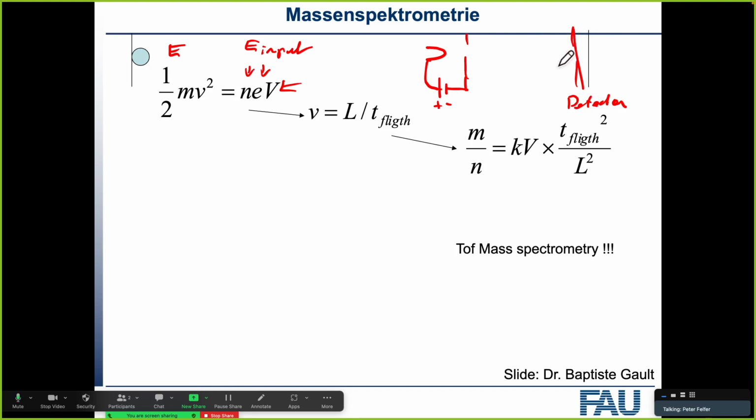In the system we use at Laser Physics, for example, it's an electron spectrometer originally, and they've taken great care to actually have a field-free drift region because they work on low-energy electrons and they are heavily influenced by electric fields. In this case, you essentially can take this equation, plunk it into your data, and it works straight away. No corrections needed.